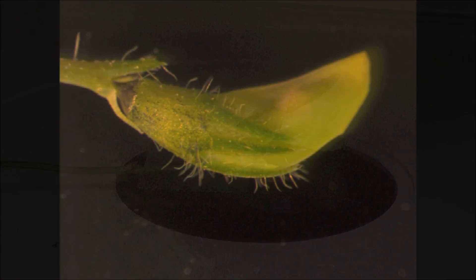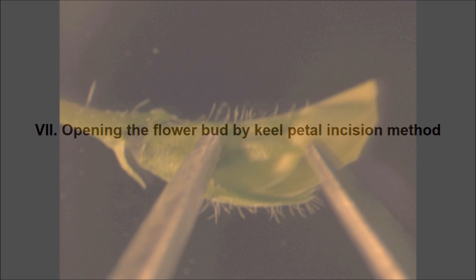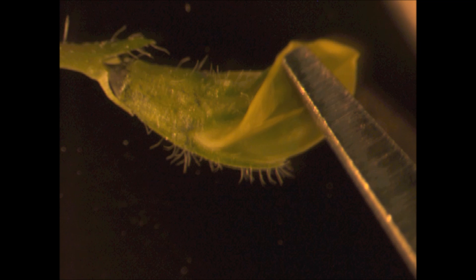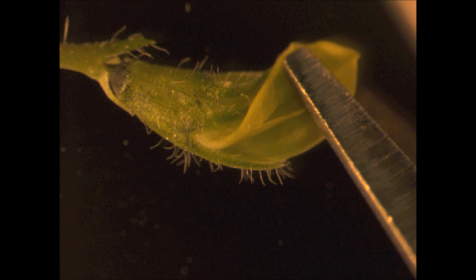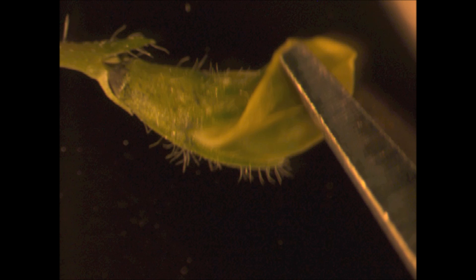Here is the mounted flower bud under the dissecting microscope. To visualize the keel petal, hold the flower bud by placing forceps on the calyx. Insert another forceps under the standard petal from its opening side and push the standard petal upwards. Now you can clearly see the keel petal under the standard petal.